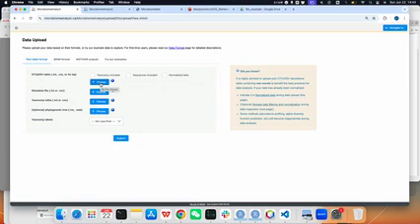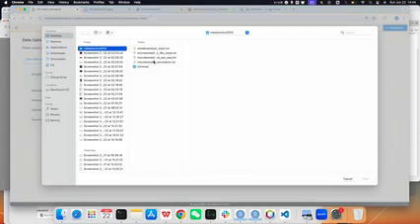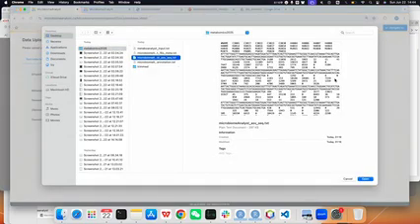From the raw data processing, in the last section I have shown that we got the sequence, you can see the ASV sequence, not only the ID. So with that sequence abundance, we can check here, and later this is for the functional prediction part. And here we just choose the file we got from the raw data processing.